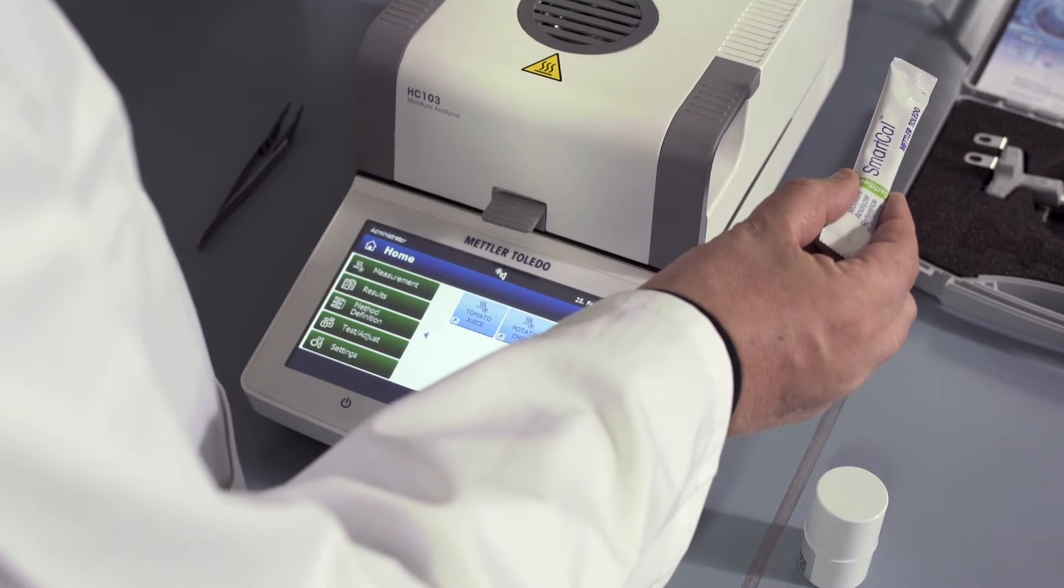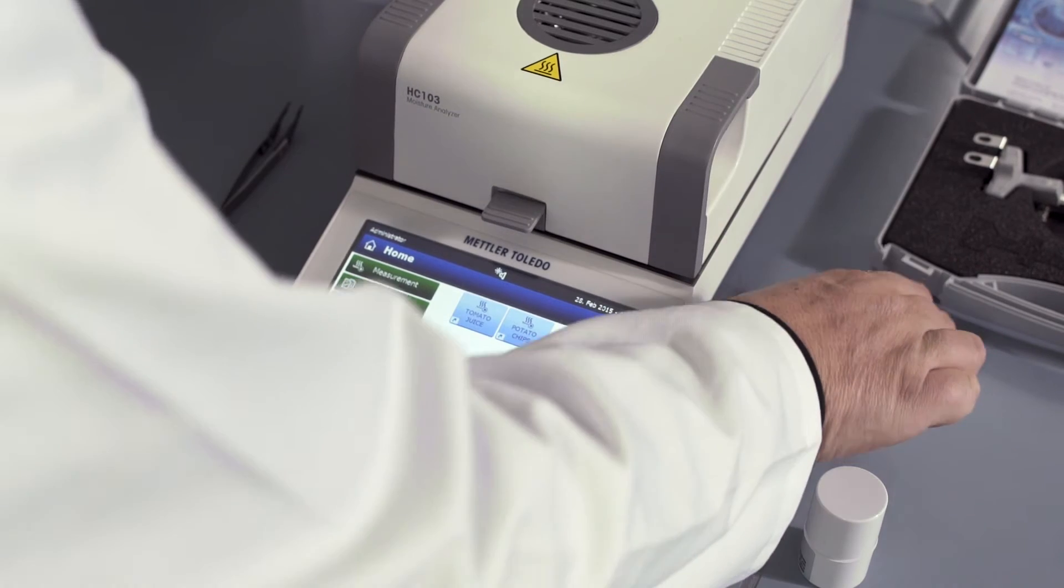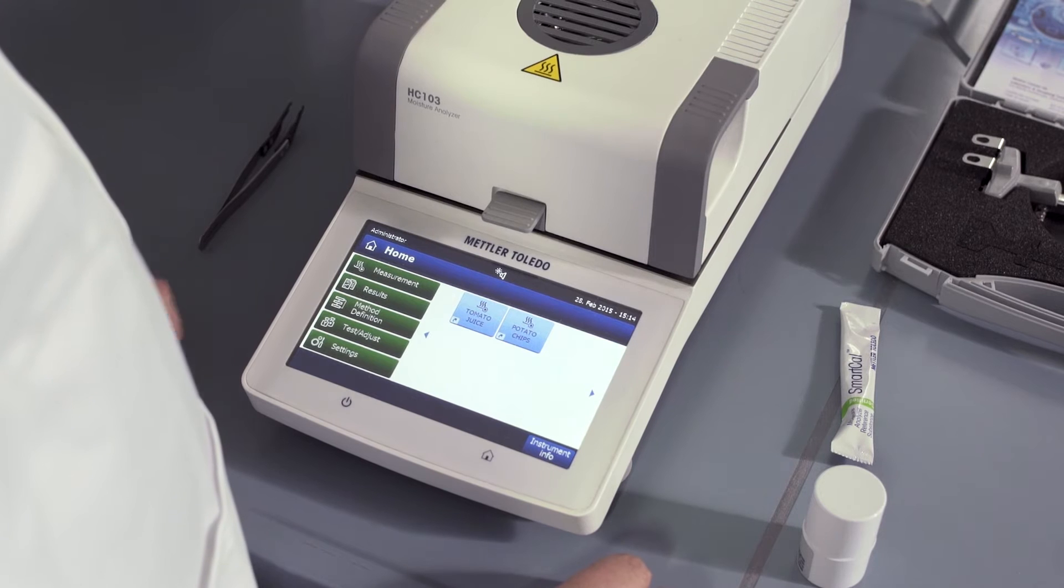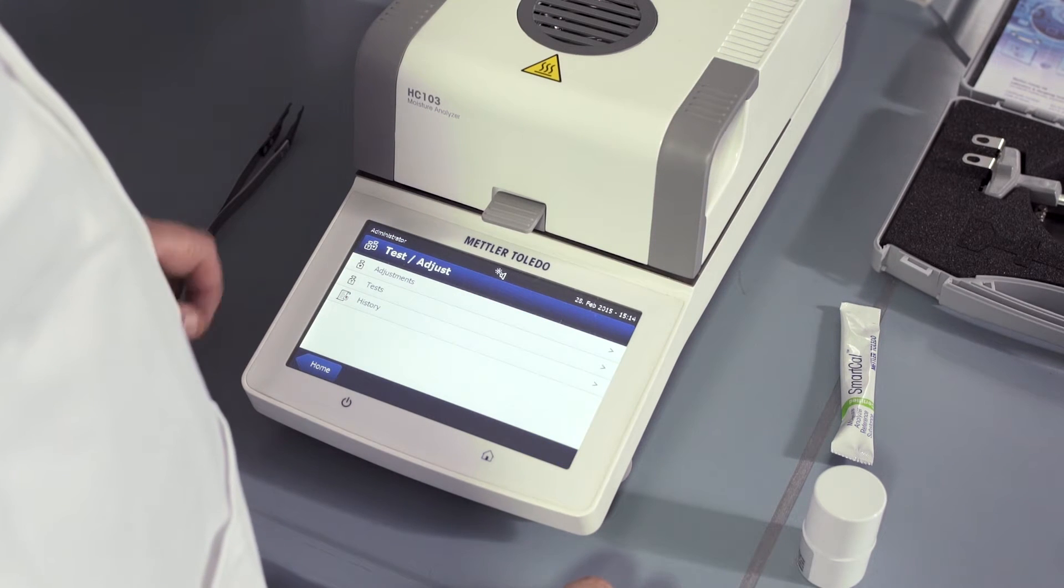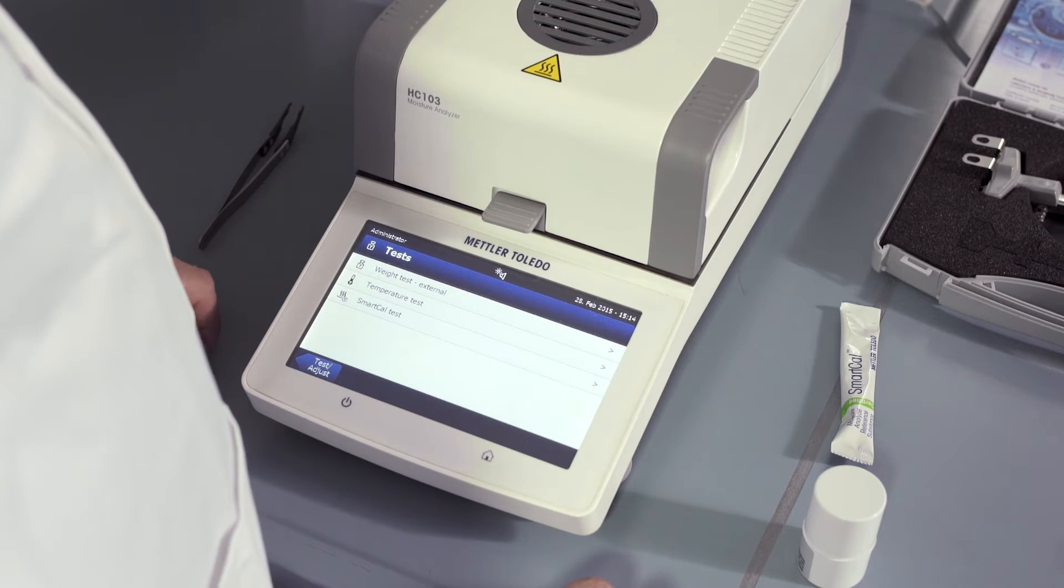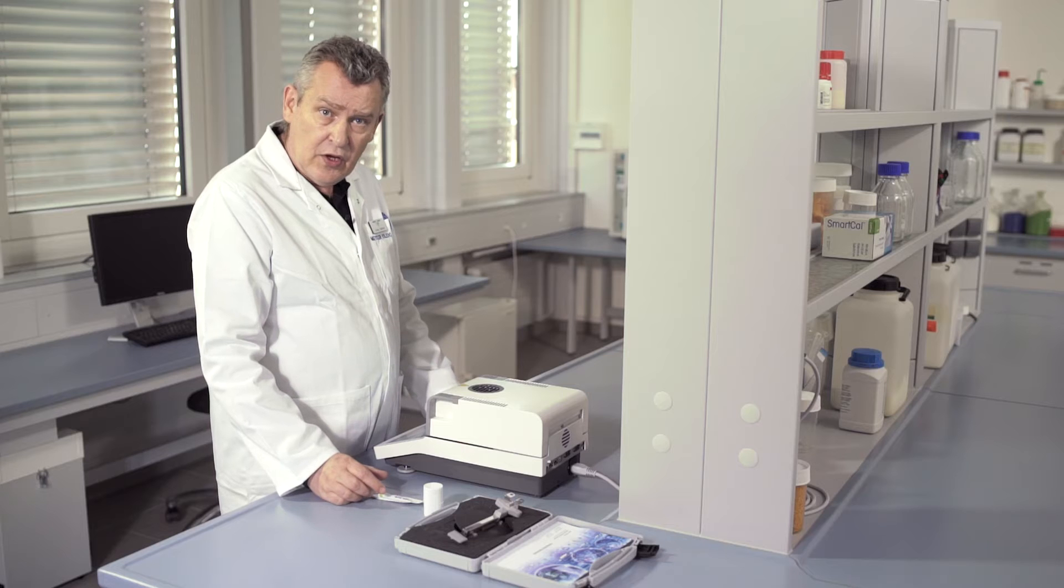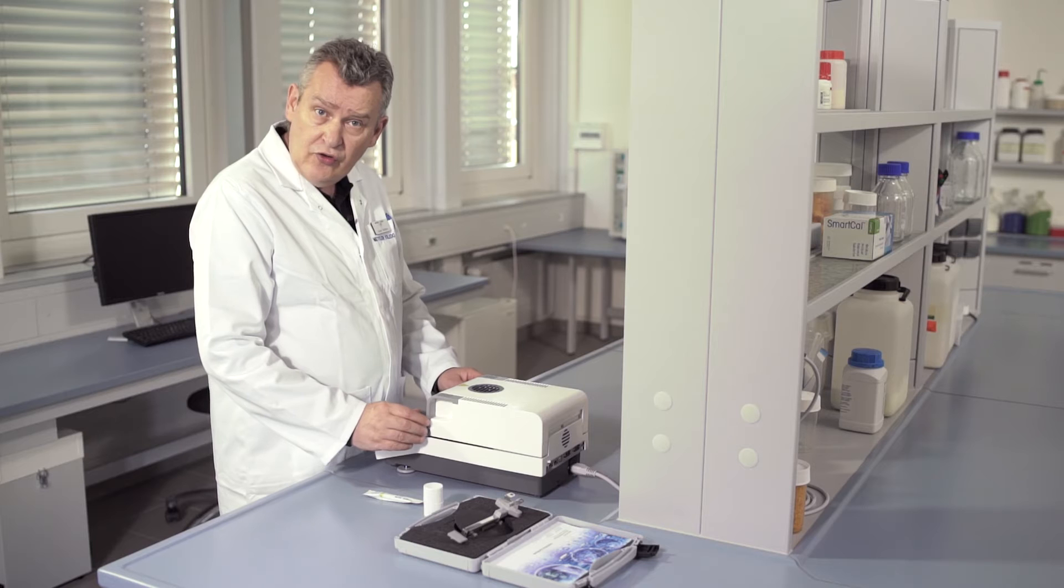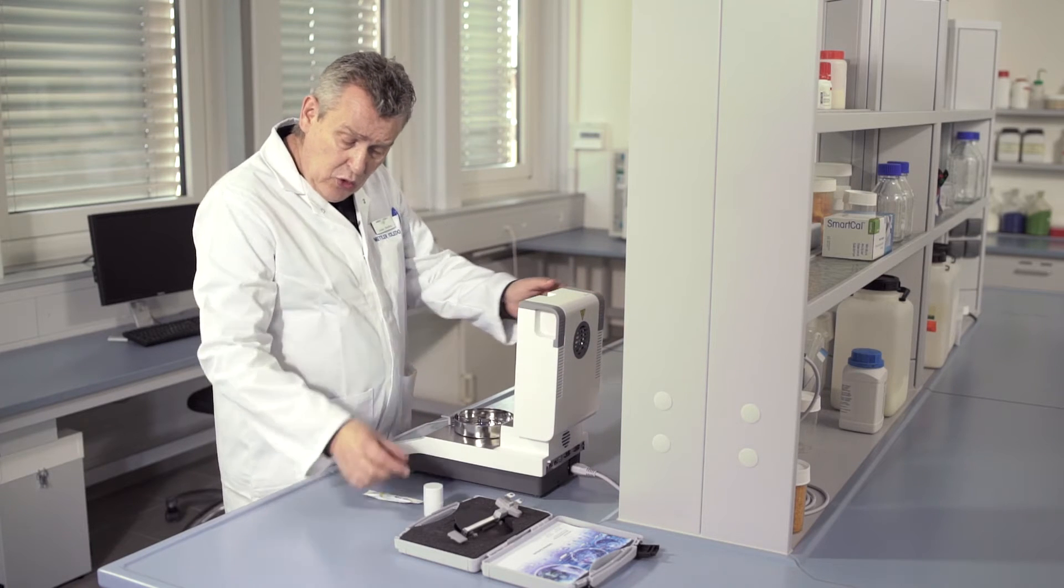To test the weighing unit, press the test adjust button, then press tests and select weight test external and start the test. The instrument instructs you to place a 100 gram weight on the weighing pan and then to remove the weight. After removal of the weight, the test procedure is now finished.